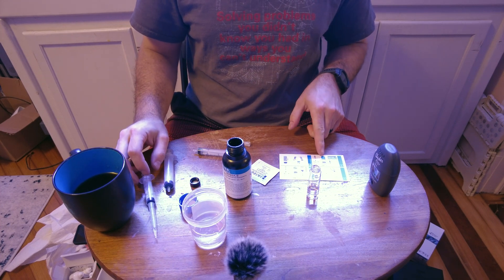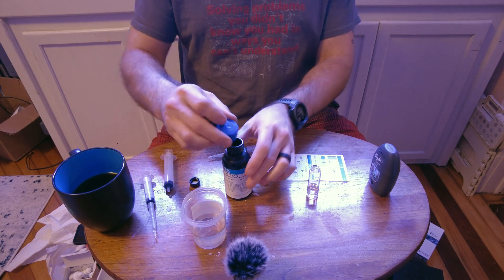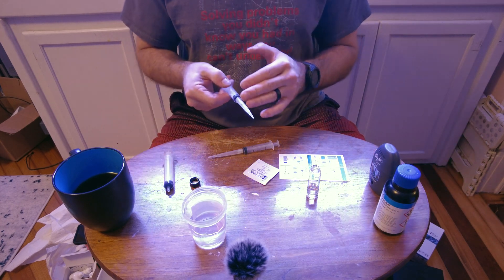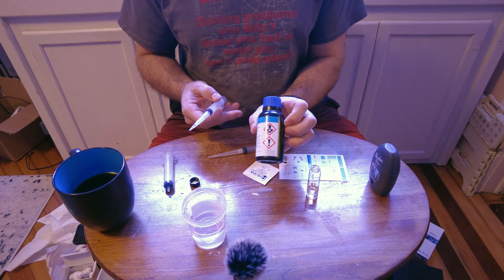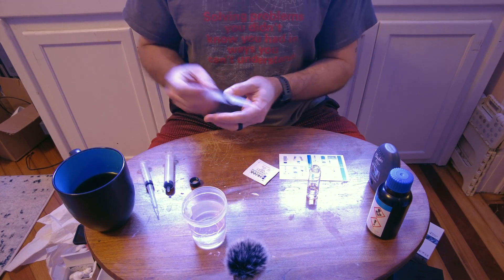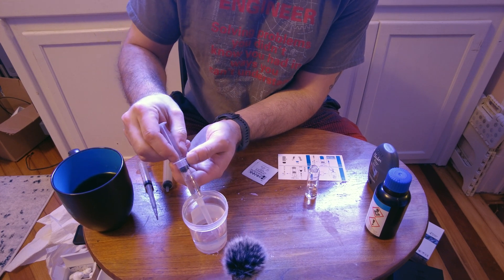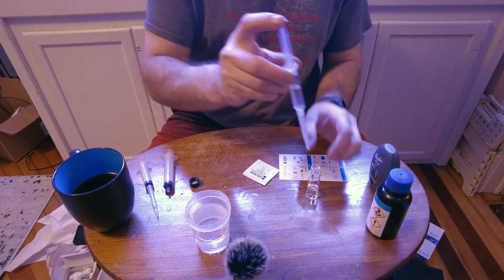The next step is to add five milliliters of tank water using the other tip — a different tip from the reagent one. If you take it directly from your aquarium, you risk reagent residue getting into your tank; this reagent has a couple of hazard warnings on it. Draw up your five ml to the stopper, not the liquid.